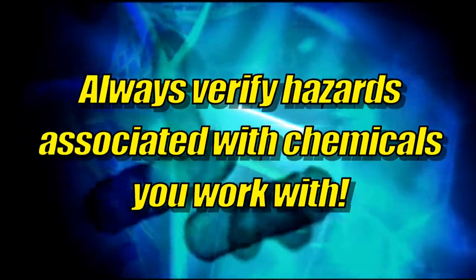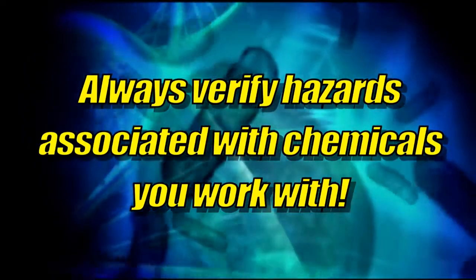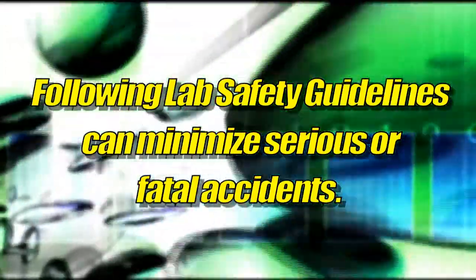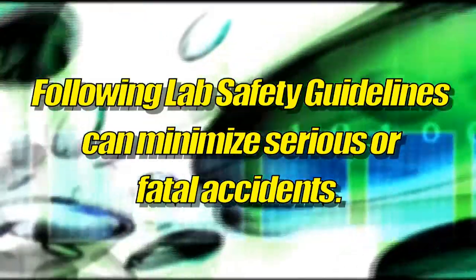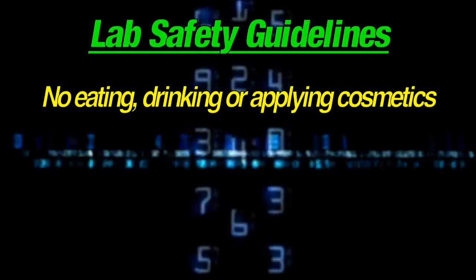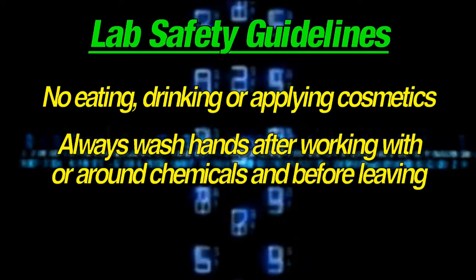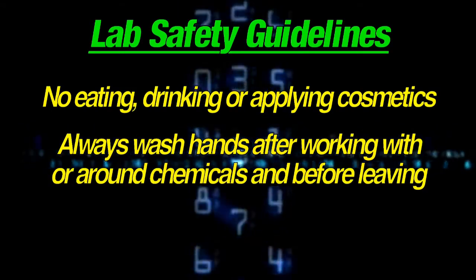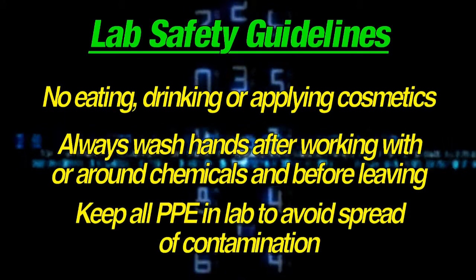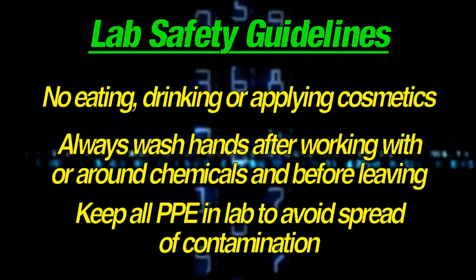There are many documented examples of serious or fatal injuries while working in laboratories. And while not all accidents will be avoided, the risks can be minimized by following lab safety guidelines. For example, there is no eating, drinking, or applying cosmetics in the lab. Always wash hands after working with or around chemicals and before leaving the lab. To avoid the spread of contamination, keep all PPE in the laboratory.